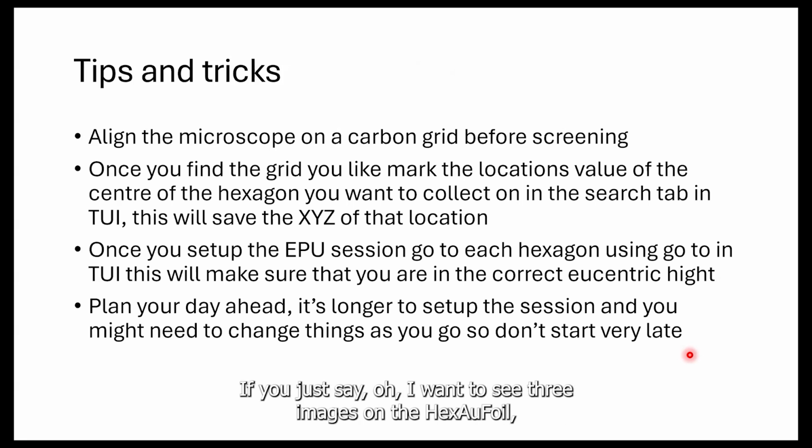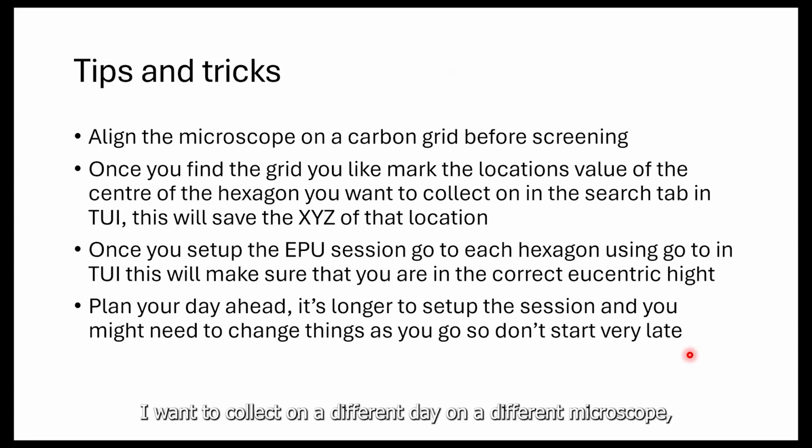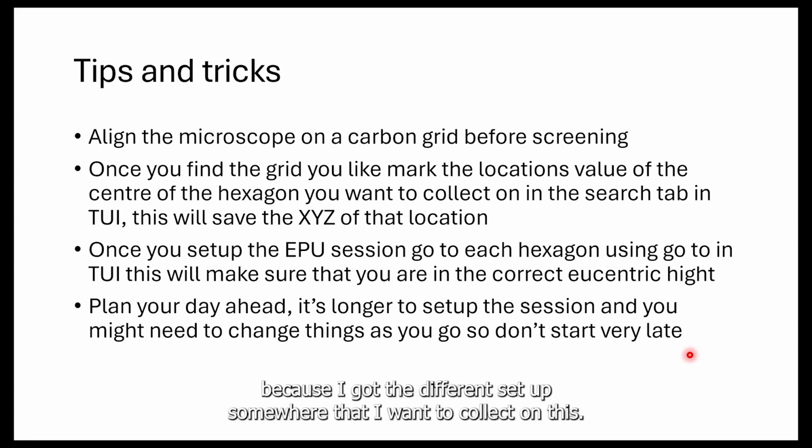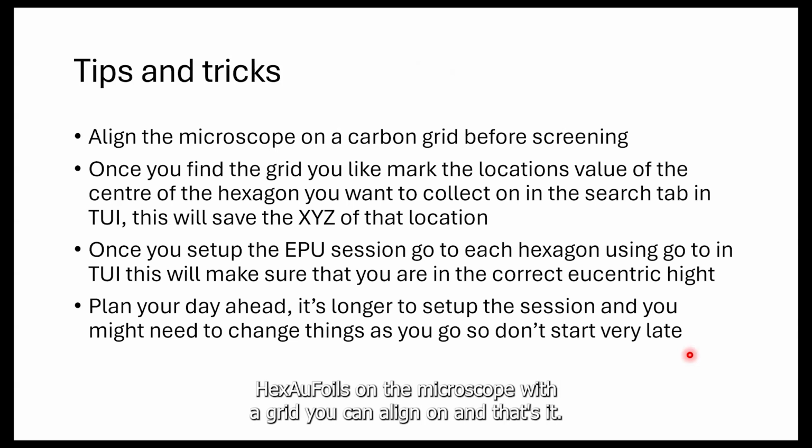If you just say, oh, I want to see 3 images on the HexAuFoil, but I don't want to collect on it, I want to collect on a different day on a different microscope because I got a different setup somewhere that I want to collect on this. Fine, it's okay. You can do this. But if you want to collect on the HexAuFoil, just load HexAuFoils on the microscope with a grid you can align on, and that's it.